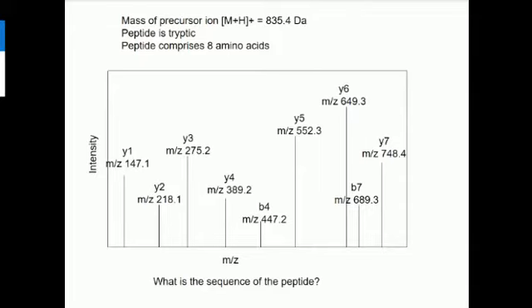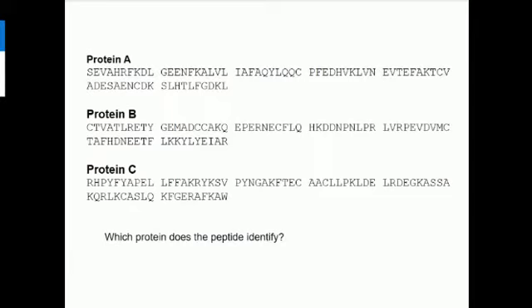Given that we now know what the sequence of that peptide is, which of these three proteins have we got? Who said that?